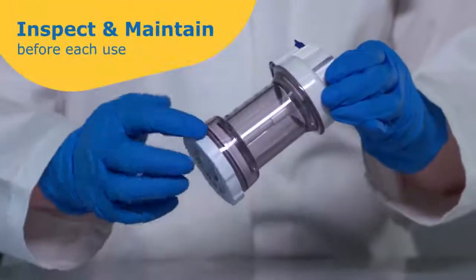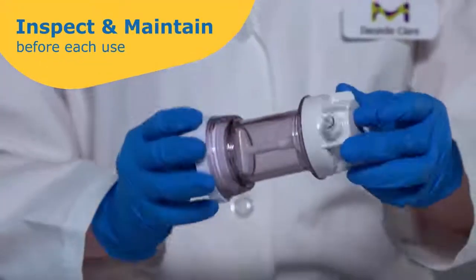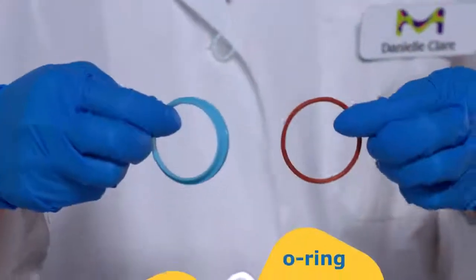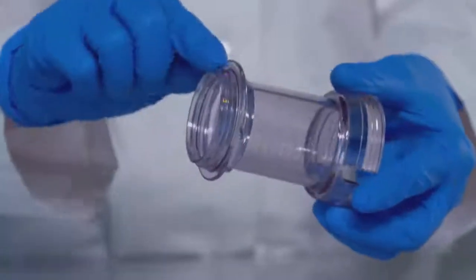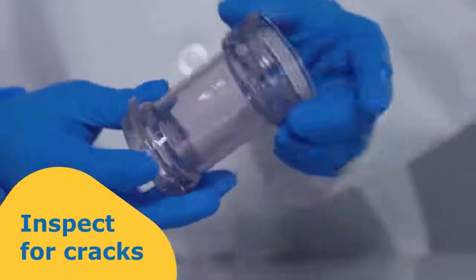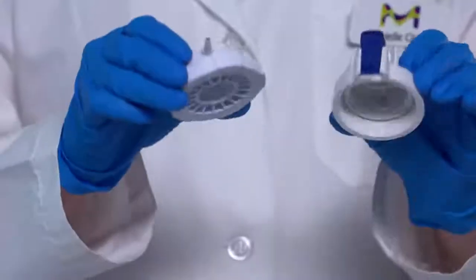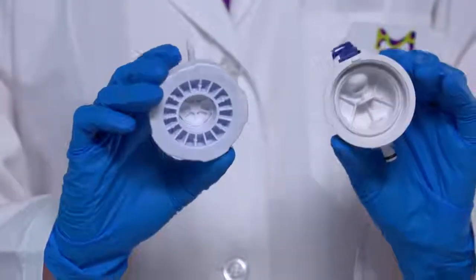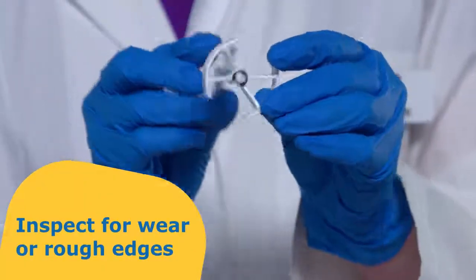Before each use, inspect and maintain your Amicon stirred cells. Replace the o-ring and gasket at the first sign of damage or wear. Periodically inspect the cell body for cracks. And inspect the stir bar for washer wear or rough edges which could damage the membrane.